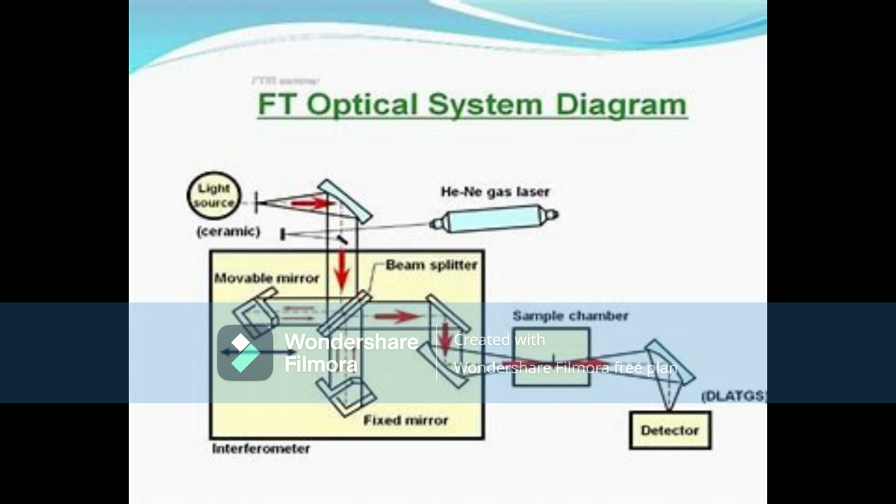This means that as the interferogram is measured, all frequencies are being measured simultaneously. The use of the interferometer results in extremely fast measurements.